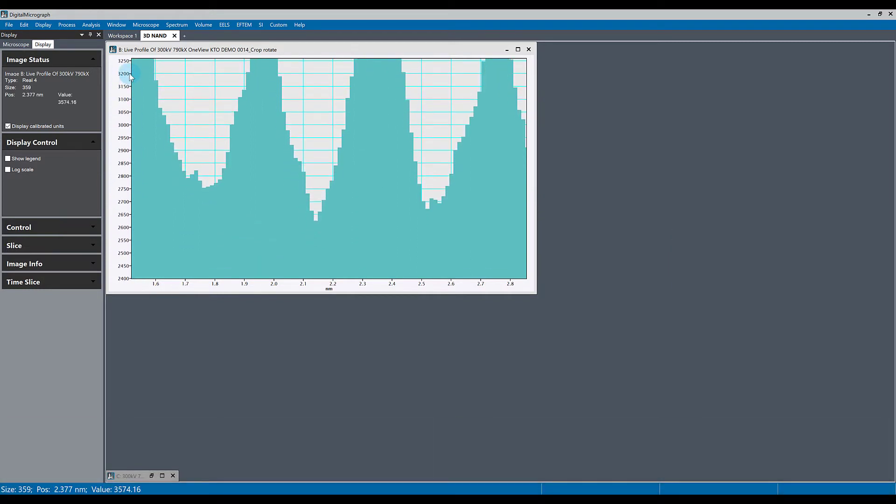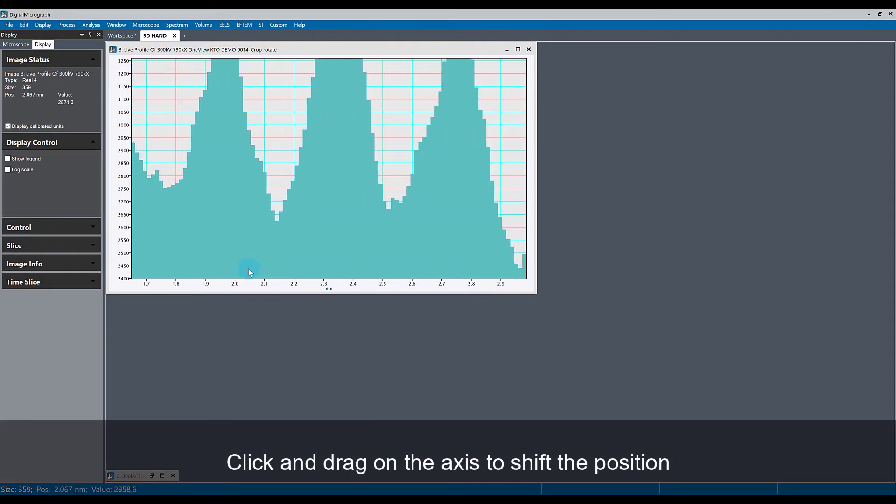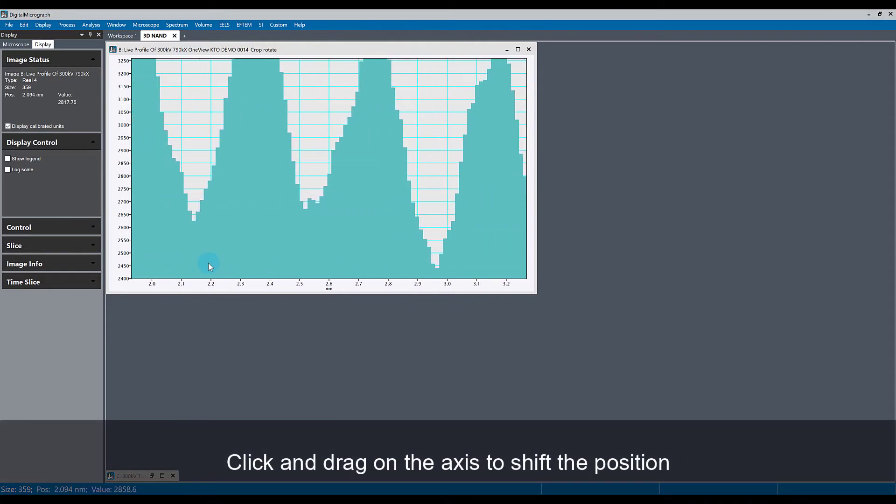For example, you also want to be able to shift the line profile around. You can do this by just clicking and dragging on the line profile without holding anything.